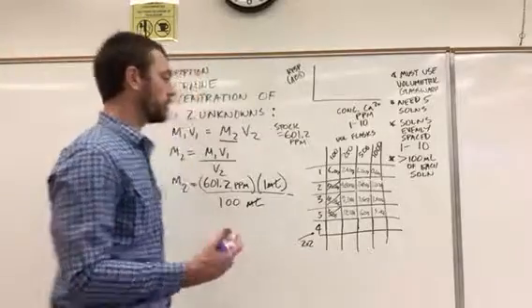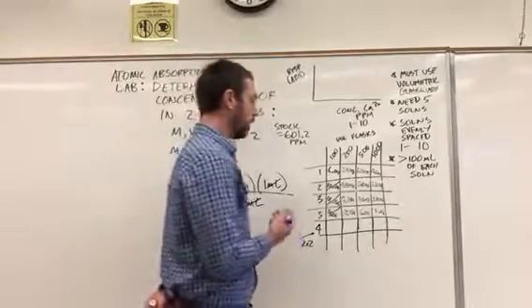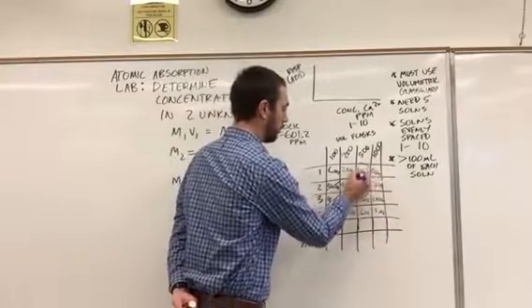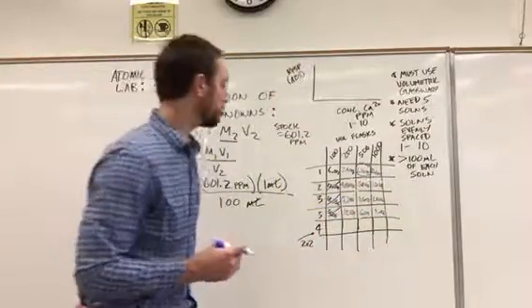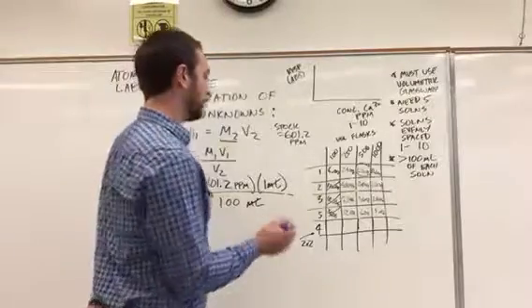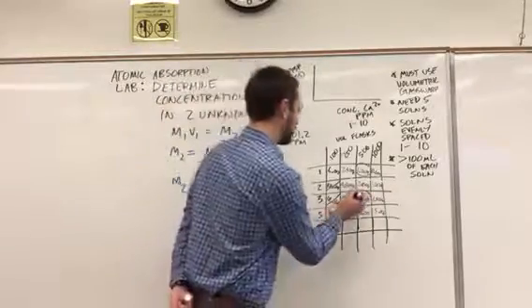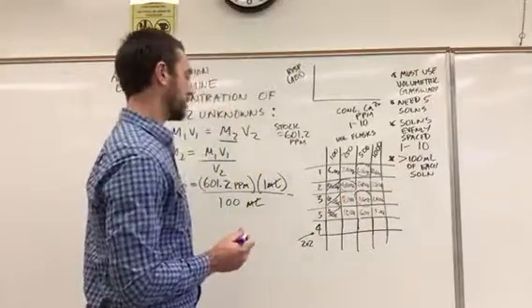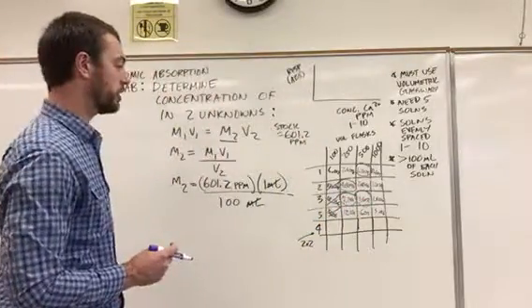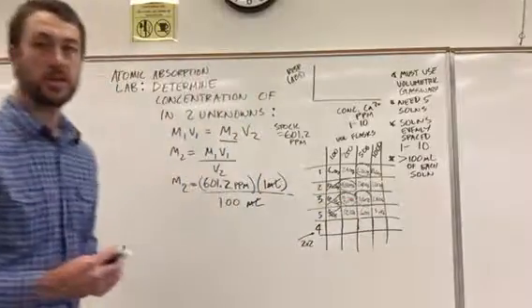So the other thing we're going to want to do is pick solutions that are spaced out, right? So the lowest concentration that's between 1 and 10 would be 1.2024, okay? And then we can kind of go up the line, right? The 3.6072 looks good, the 4.8096 looks good, the 7.2144 looks good, but you'll notice that that's the highest concentration we have.